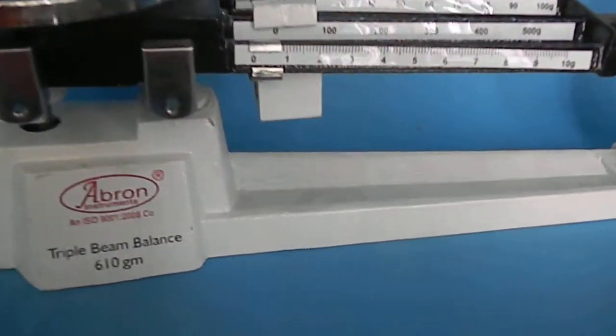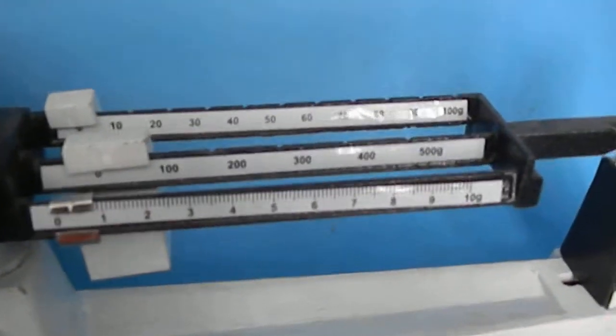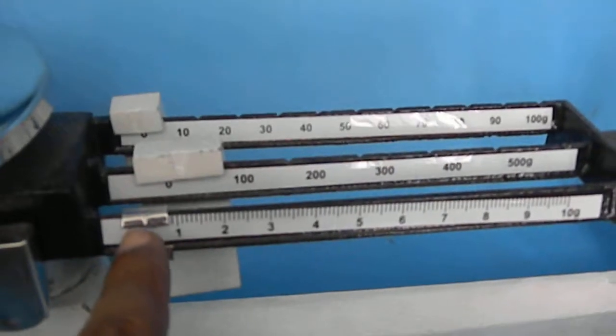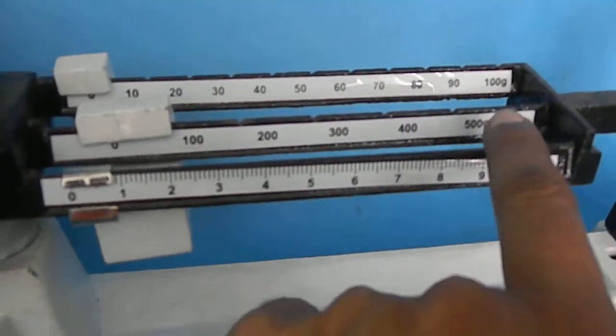There is a bronze triple beam balance of 610 grams. It has three scales: one weight which is for up to 10 grams, 500 grams, and 100 grams.